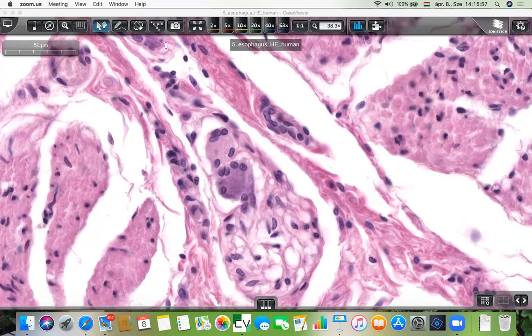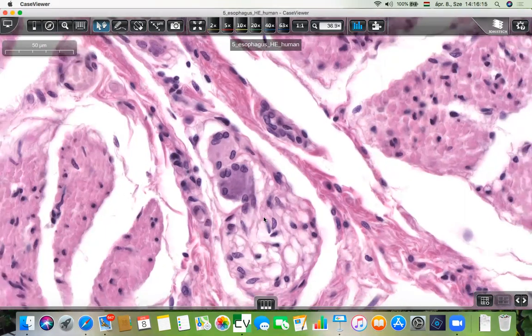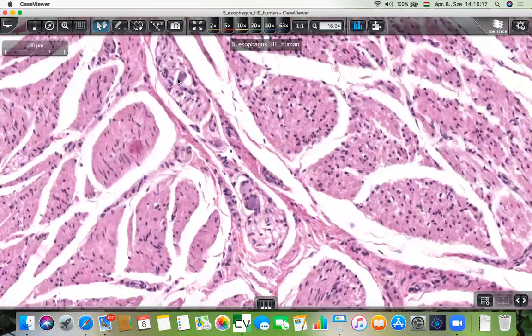Dr. Katz, yes. Can you repeat again? They represent parasympathetic ganglionic cells and? Parasympathetic ganglionic cells, these are the darkly stained ones. And these are the nerve fibers, the unmyelinated nerve fibers. Okay, thank you. Welcome.